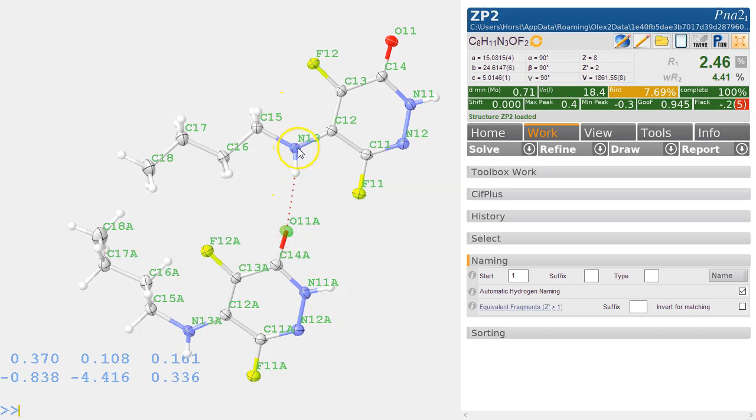There's a number of ways of doing this. One of them is this one, but I'll show you a different way. You can click on this one all the way and it's literally just name -n -s for suffix equals, we want to B. So this is the other way of doing this for one particular entity. There's no transferring of name, but we now have consistent naming in that sense.